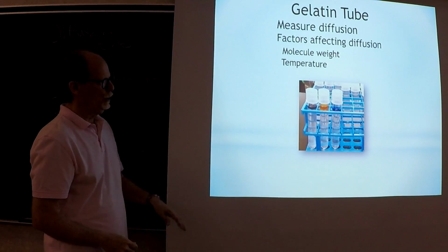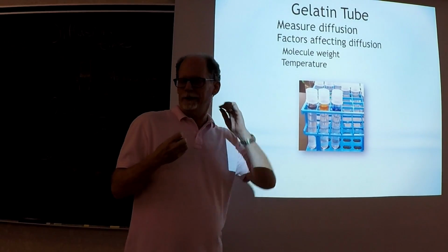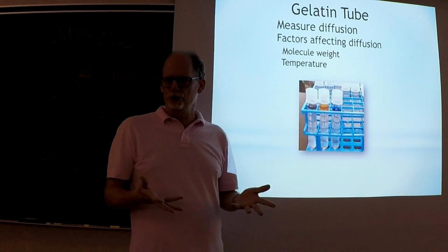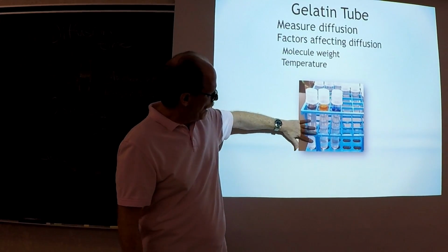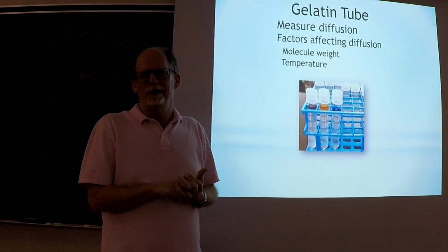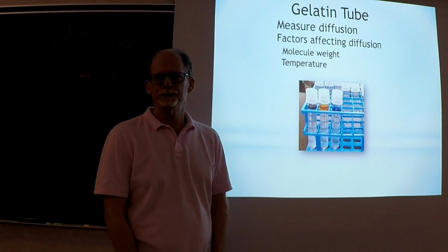Okay, so these gelatin tubes are used as a model for diffusion inside gelatin. It's not the optimal experiment, but gelatin's cheap, and it's easy to make the tubes.